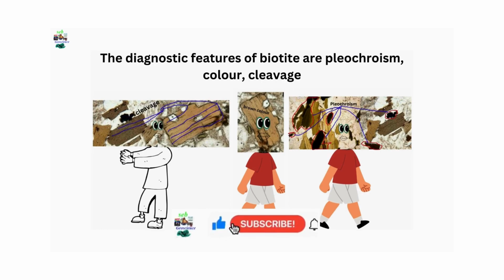It has one set of cleavage in the microscope also. Its color is brown to white, or most of the time brown, and it shows what? Pleochroism. That means brown to white, brown to white. This color change in plane polarized light is called pleochroism. So the diagnostic features of biotite in the microscope are these three properties.